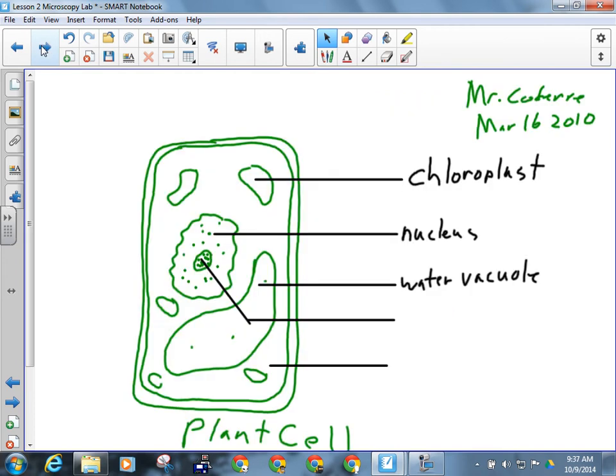The lab drawings. This is kind of the format of them, and I worked really hard to draw this plant cell, and it's still terrible. But they do need to be in this format. If you look on the sheet I gave you, turn it over, there's a proper lab diagram there on the back. You do have to follow this format, because when you get to university, this is the format they're going to want it in, and they're really, really anal about how you do it. If you don't do it their way, you get it wrong.